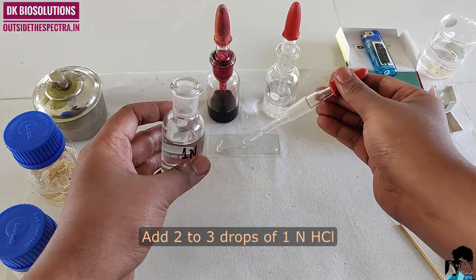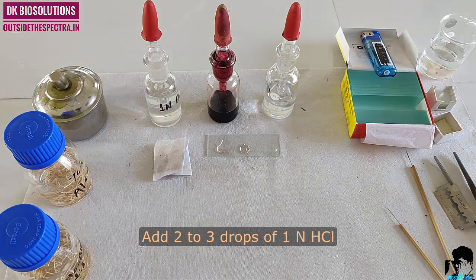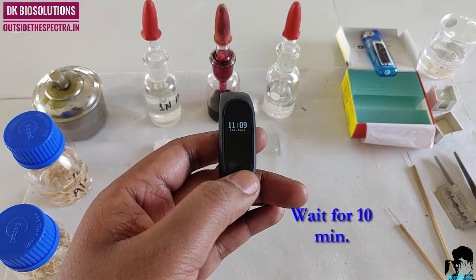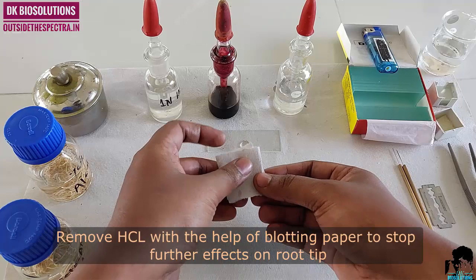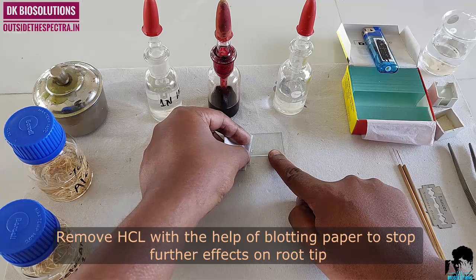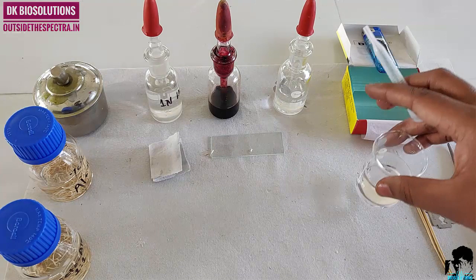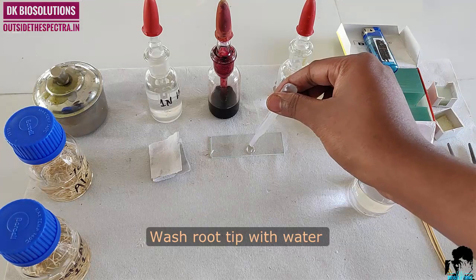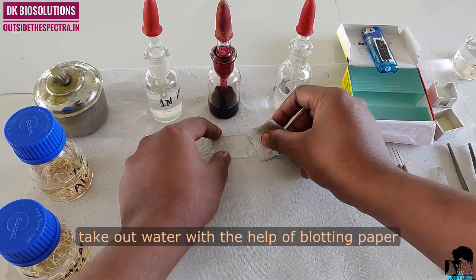Now add 2–3 drops of 1 normal HCl. For proper hydrolysis in 1 normal HCl, wait for 10 minutes. Remove HCl with the help of blotting paper to stop further effect of HCl on root tips. We will wash our tip with water, then again take out the water with the help of blotting paper.